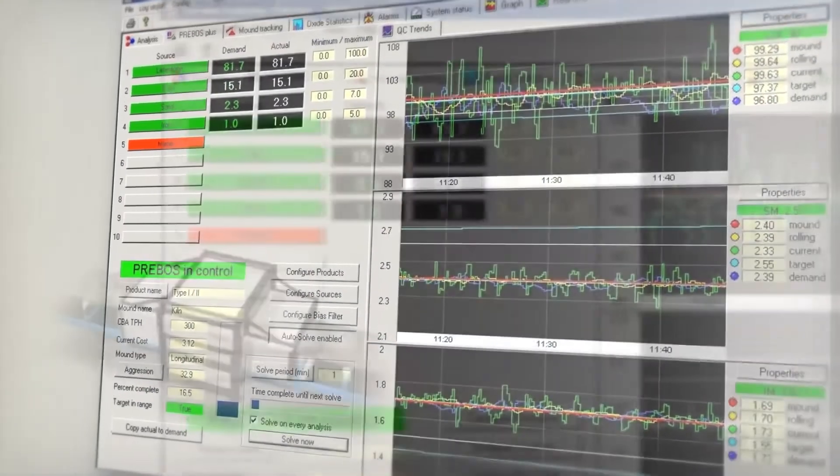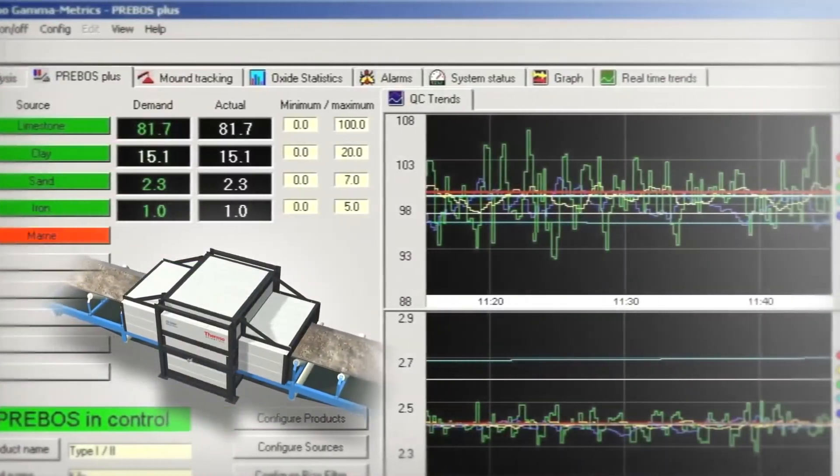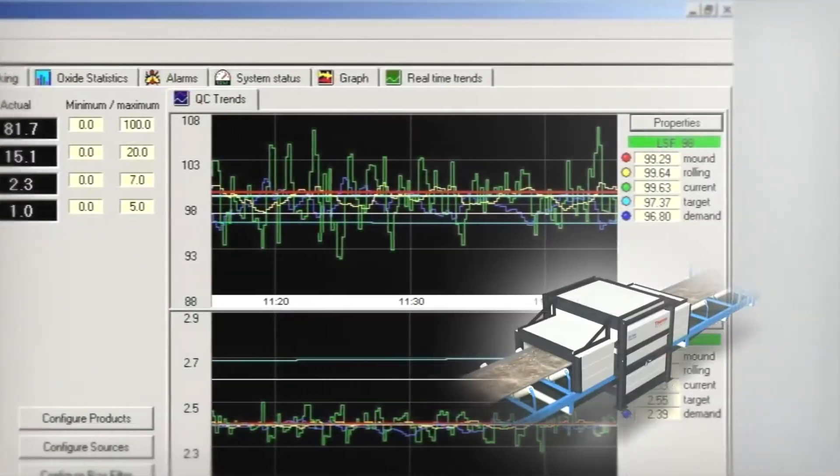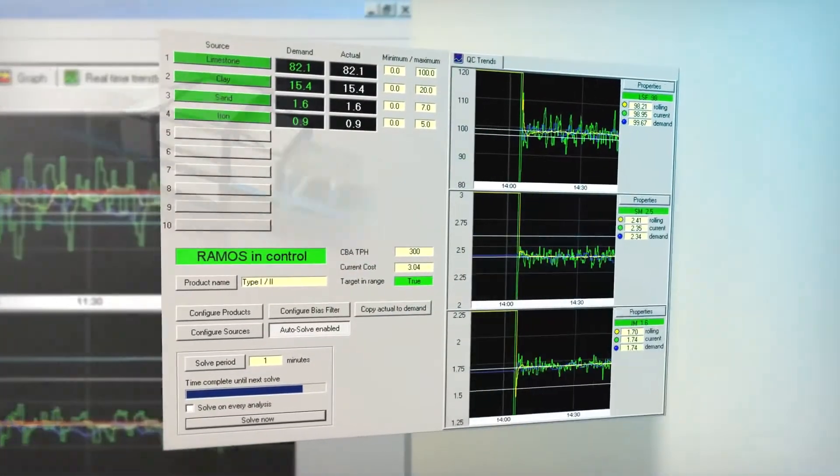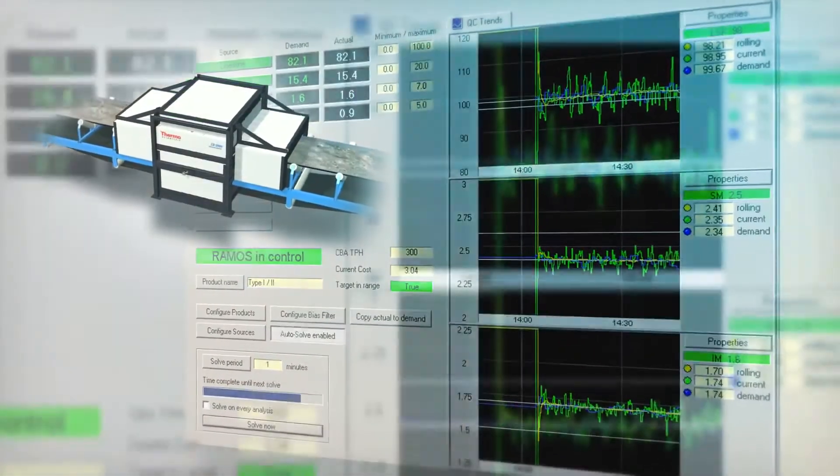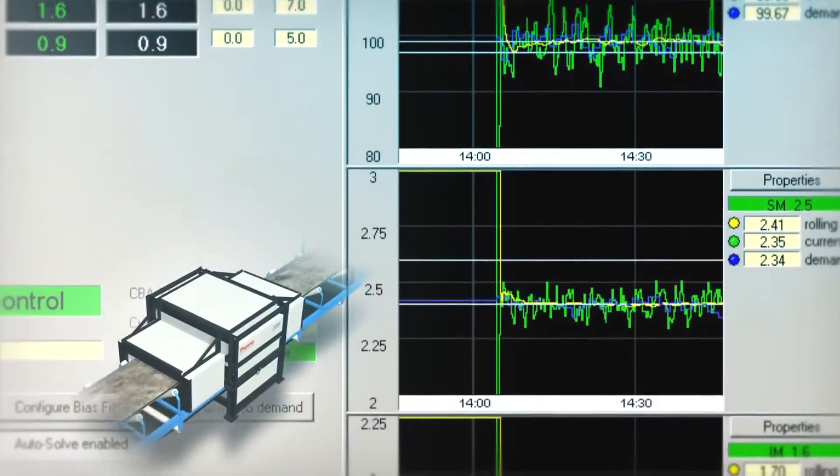allows quick and accurate changes to be made to the process. This high-frequency control provides a unique and reliable means to achieve consistent raw material quality with minimal chemistry deviation.